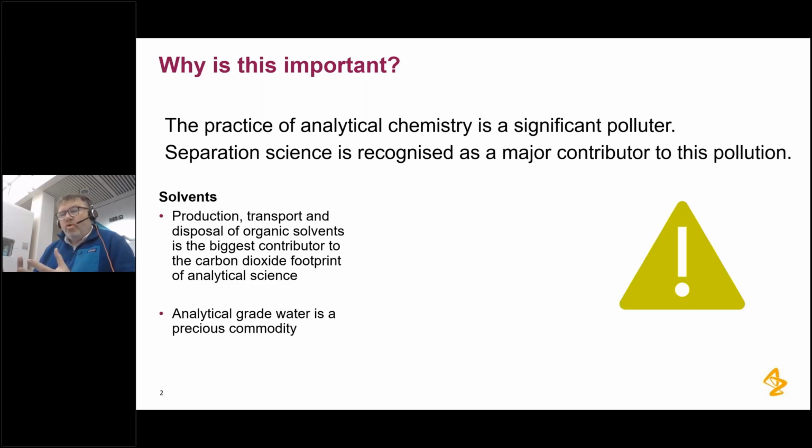Thinking about water as well, water is a precious commodity, and what we need to do is be really respectful in how we use water, how we achieve pure water, where we get our water from, but also how we return that water to the environment in a pure state. So making sure that our analytical grade water is used responsibly is also really important, which is a big driver in how we can do our method development in a more sustainable way.